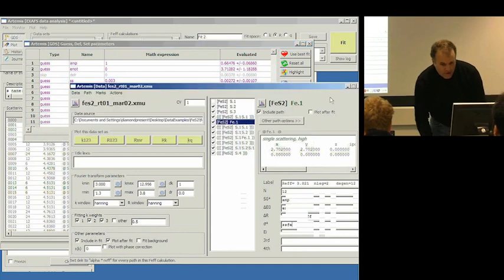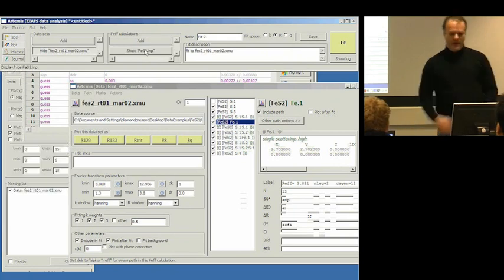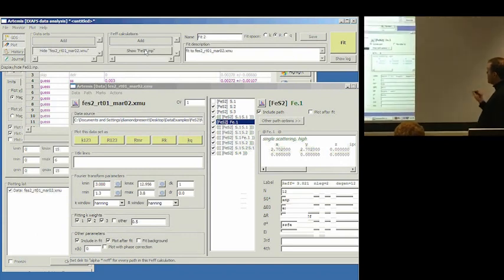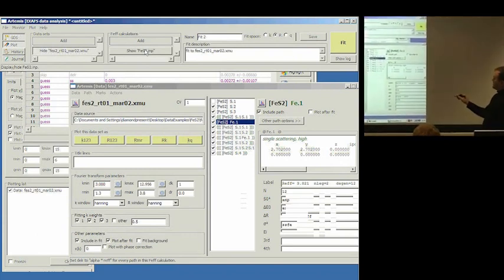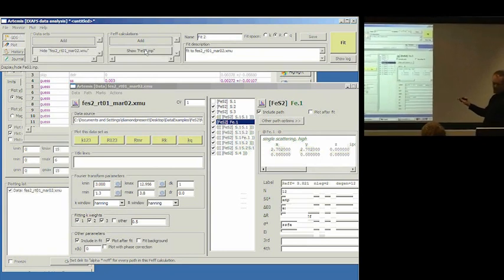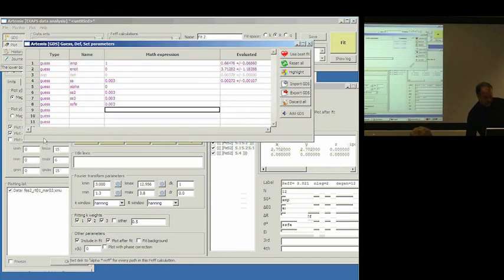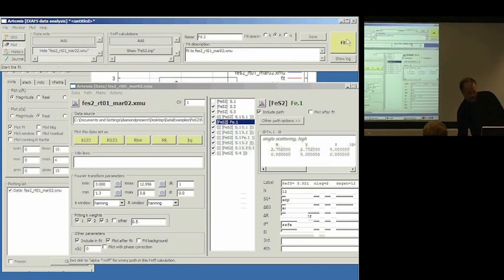So now we're about ready to hit the fit button. We're about ready to hit this guy. We've set the fitting range to cover the first big peak and that next blob of peaks. We've included our first 4 single scattering atoms. We have defined our 7 parameters up here. We've used them all in a sensible way down here. So yeah, I think we're ready to hit the green fit button.